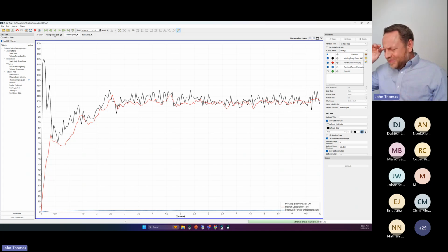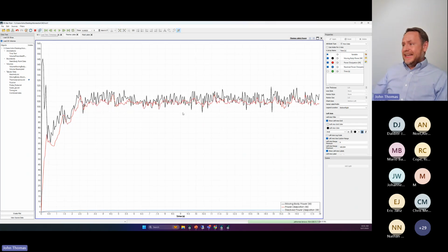I know I'm talking so aggressively about strain. I don't know why. I need to chill out. But it's an important point. If you're not conserving energy and you can't confirm that your local EDR is valid, how can you hang a KLA calculation on that? How can you hang a dissolution? How can you hang shear? How can you hang anything on it if you can't show that you're getting energy dissipation right across the vessel? Here we can, and it's pretty cool. We'll see that get nailed.